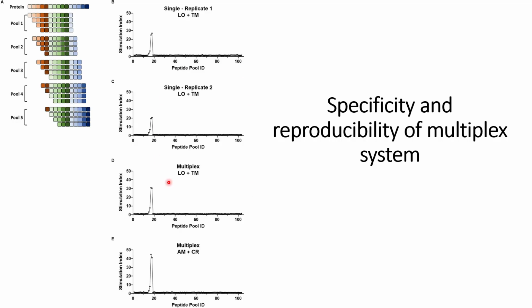From these results they validate the efficiency of the system they developed, the 8XNFAT reporters, which can be used to generate signals for activated T cells.